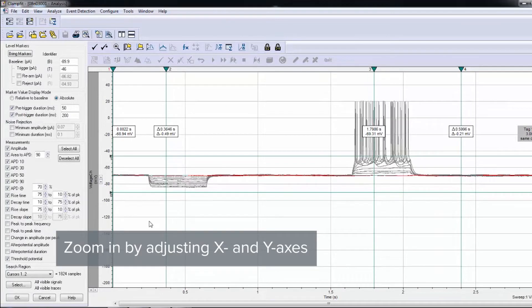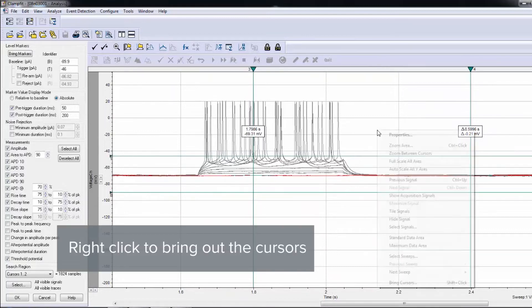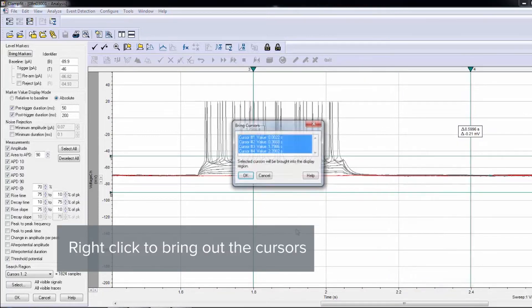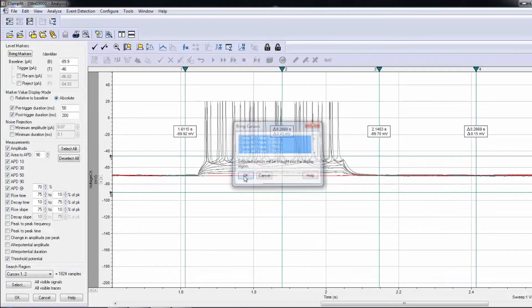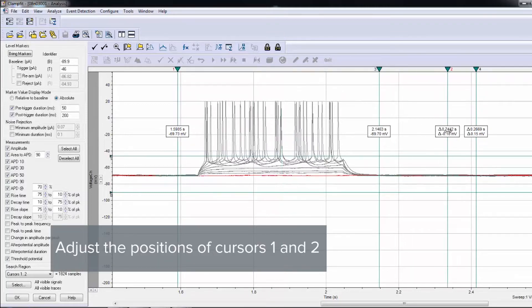Zoom in accordingly by adjusting the X and Y axes. Right-click the mouse to bring out the cursors. Adjust the positions of Cursors 1 and 2.